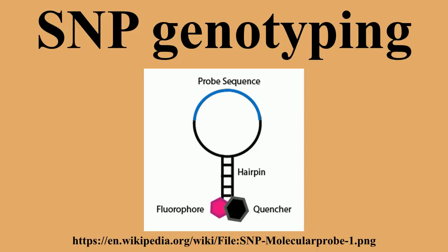A SNP will result in a lower than expected melting temperature. Because genotyping is measuring a quantifiable change in melting temperature, it is capable of measuring all types of mutations, not just SNPs. Other benefits include its ability to work with label-free probes and its simple design and performance conditions.